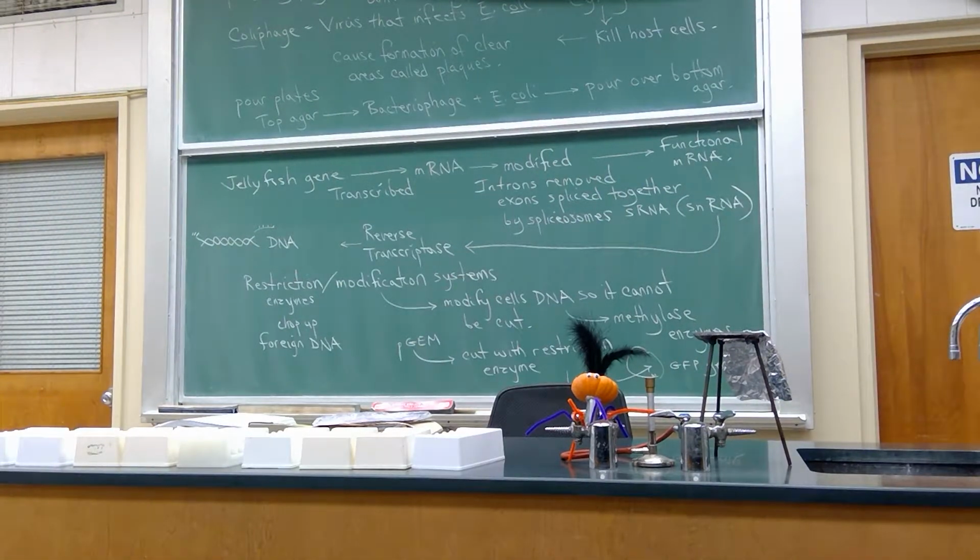For this set of exercises, you need 7 tubes of top agar melted. My recommendation would be that you melt more than 7, because if somewhere in the exercise you mess one of them up, you don't want to have to go back to the very beginning and start over again. So my recommendation would be to put 9 top agar tubes in your beaker, and I'll do a demo here.